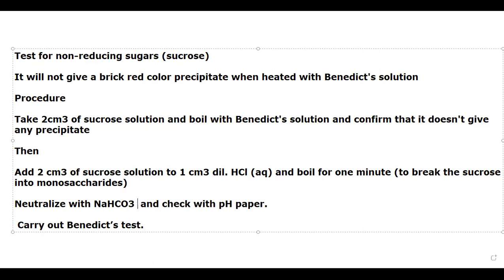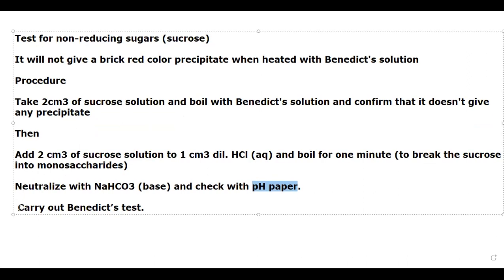Sodium bicarbonate is a what kind of material? A base material. We are adding a base and neutralize it. After neutralizing, how do we know it is neutral? We are knowing that one with the use of whom? With pH paper. Thereafter, you carry out the Benedict solution.